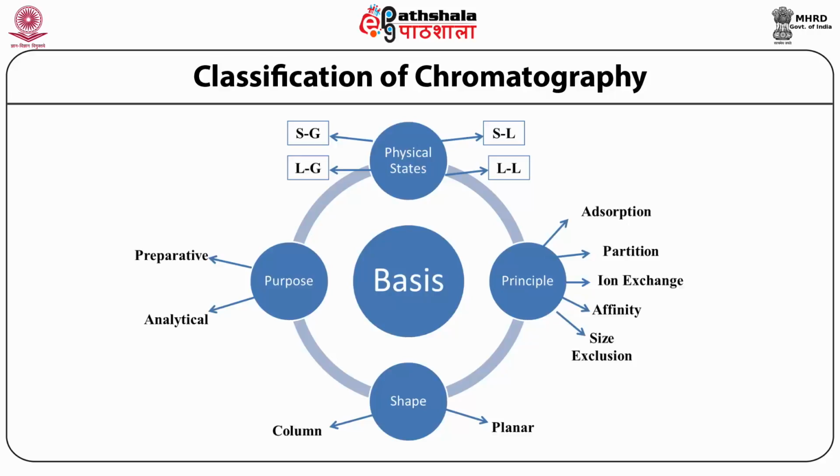Another form, second, is partition chromatography. In partition chromatography, the stationary phase is a liquid supported on an inert solid, while the mobile phase is either a liquid, as in liquid-liquid chromatography, or gas, as in gas-liquid chromatography.